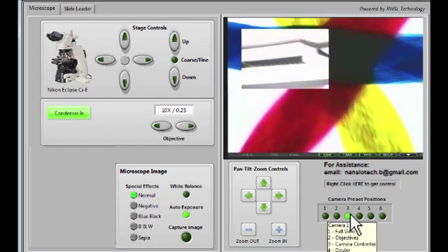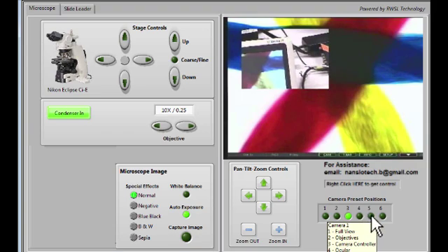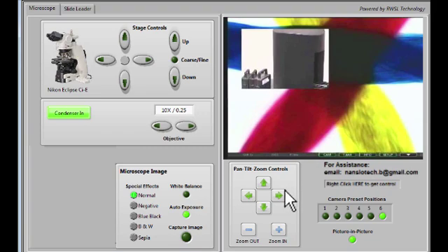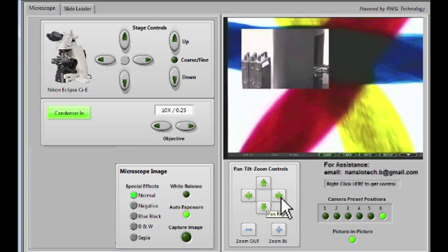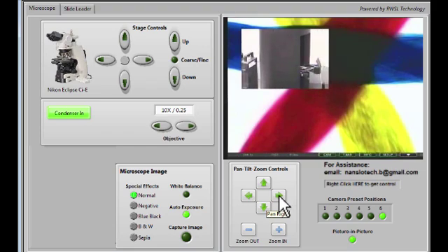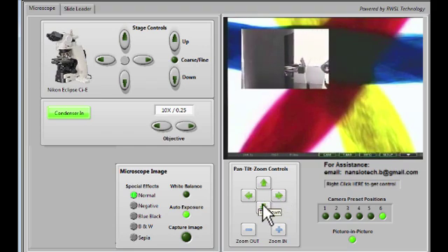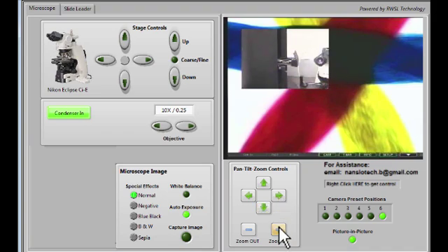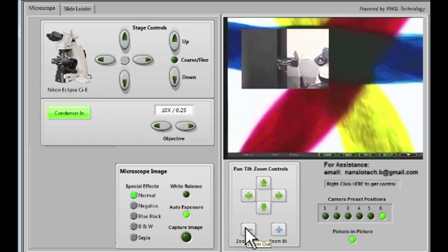We can also watch the slide loader robot as it removes the slide. In some cases, you may want to move the camera manually to get a better frame to see what you're looking at. You can also zoom in or zoom out as you wish.